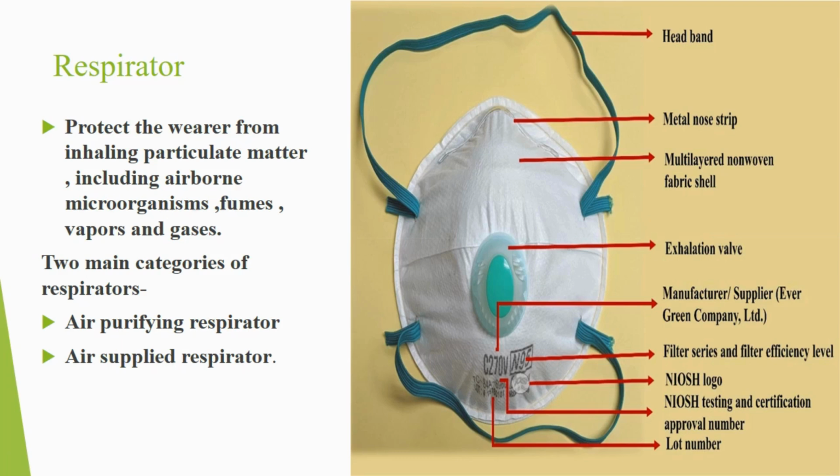Fit checking is a must. After wearing the N95 respirator, healthcare workers must perform a fit check to ensure it fits properly. No clinical activity should be undertaken until a satisfactory fit check has been achieved. So, how to do the fit check? It includes the following steps.